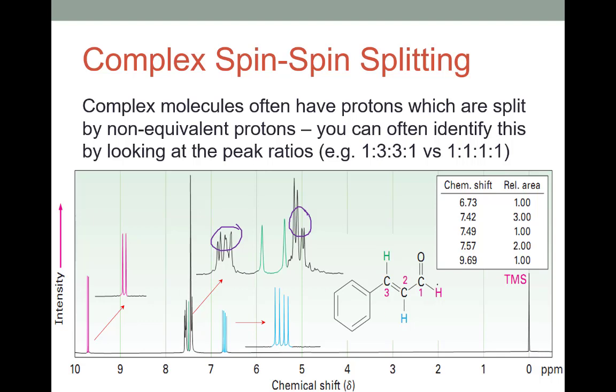And then we have our aldehyde proton. It's the first time we've seen one of those. That aldehyde proton, I told you, is one of the only things that's going to be shifted higher than an aromatic ring. And so we see it showing up over here around 9.5. I want to focus on the splitting for a minute. So our aldehyde proton in pink, if we look at its carbon, we go one step away, we see one hydrogen, the blue one. And so this is a doublet by virtue of having one neighbor.